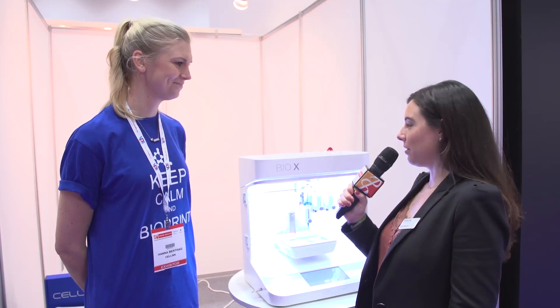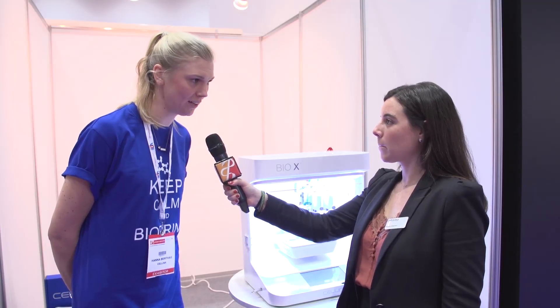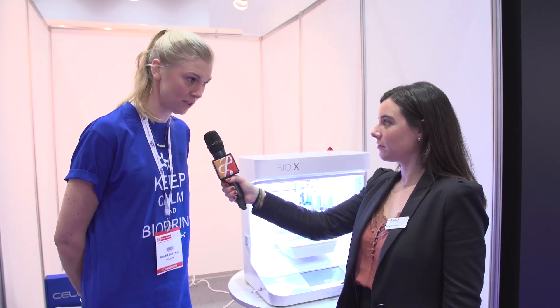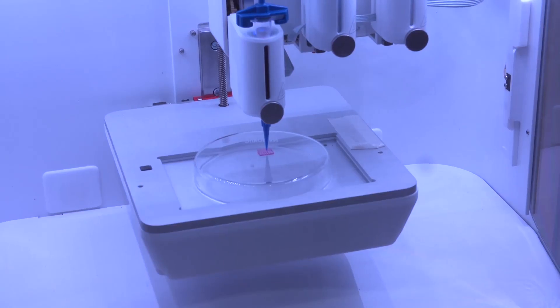So Hannah, can you print something for us now, please? Yes, definitely. So we're going to print a skin tissue model that some of our customers actually are printing with, and it's very easy. I prepared it a little bit, but we can start the printing.